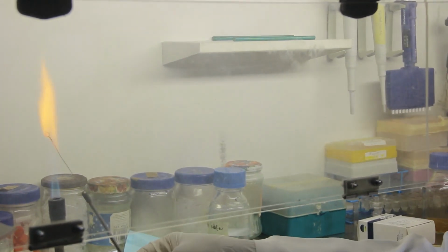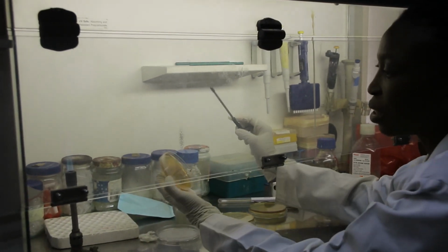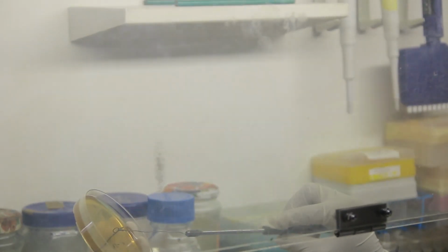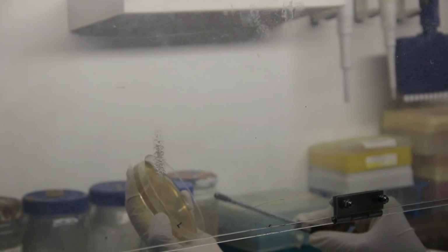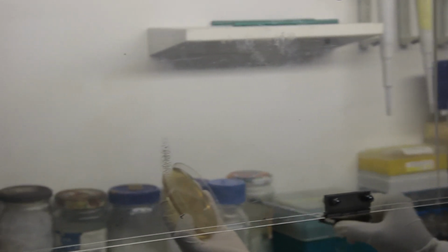The wire loop will be flamed to prevent contamination, and just one colony, because here on the plate we have several colonies, just one colony, Colony 1, will be subcultured on a fresh plate. The plate will be properly labeled for the purpose of identification. Colony 1.